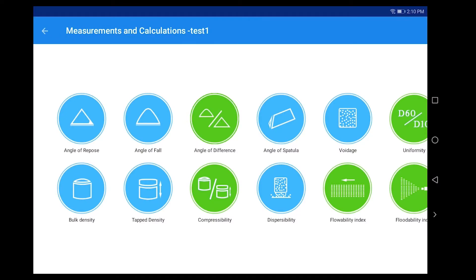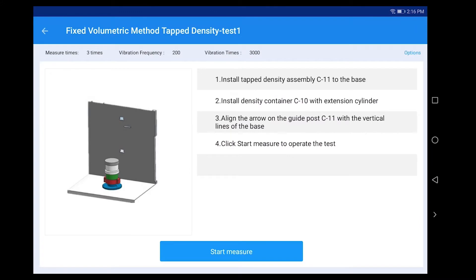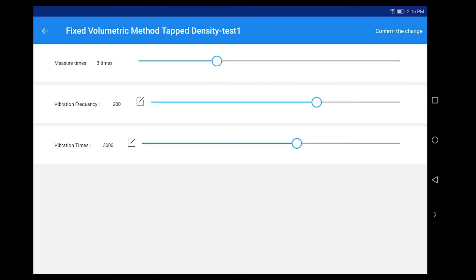Click Tap Density. Click Fixed Volumetric Method. Click Options. Set Measure Times, Vibration Frequency, and Vibration Times as required.